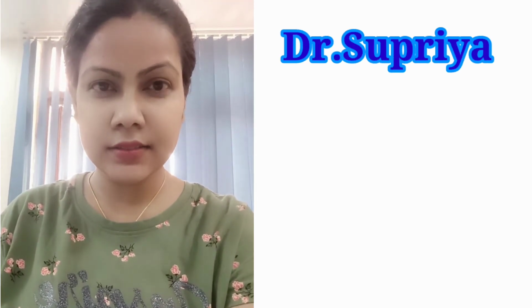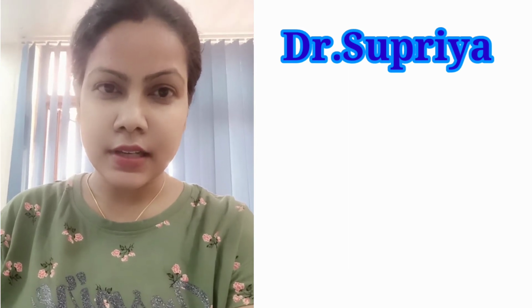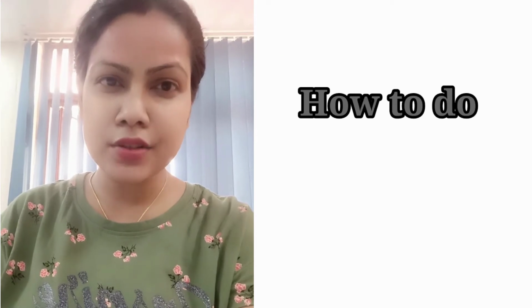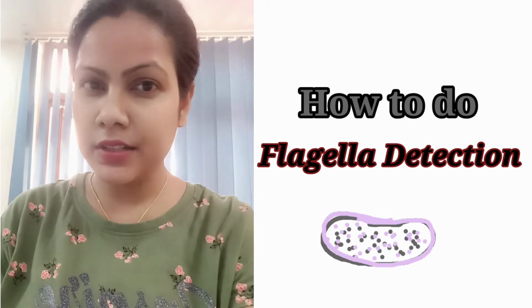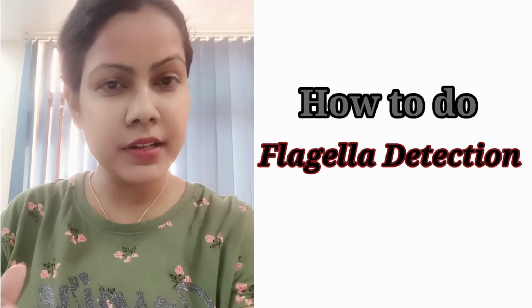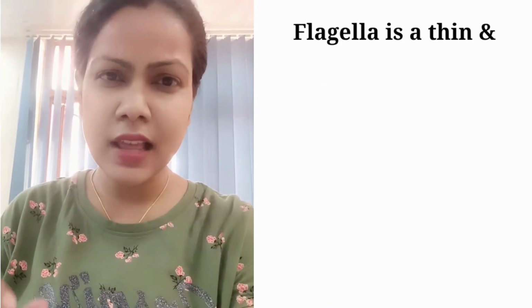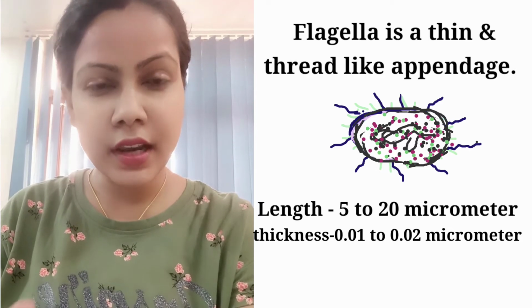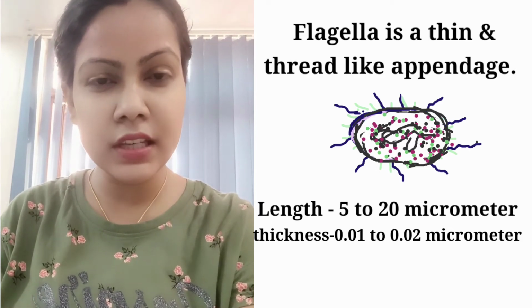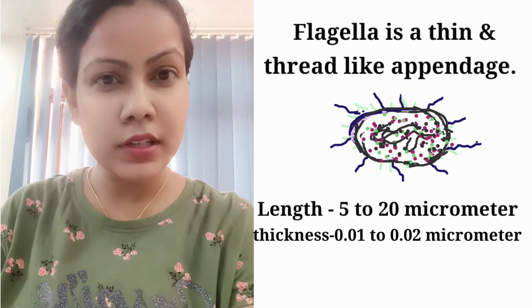Hey everyone, I'm Dr. Supriya, and in this video I'm going to discuss detection of flagella in a particular bacteria, whether a bacteria has flagella or not. Flagella is a very thin structure, and for detection of flagella we need a particular step.